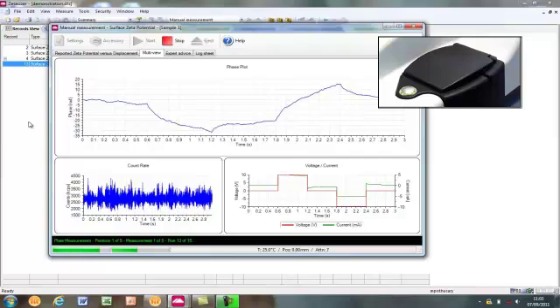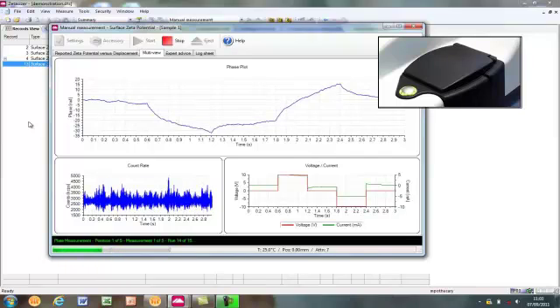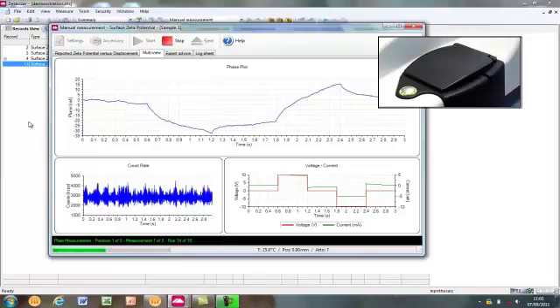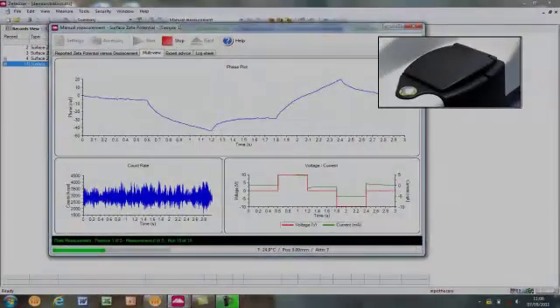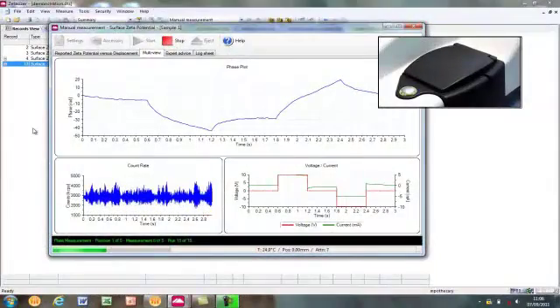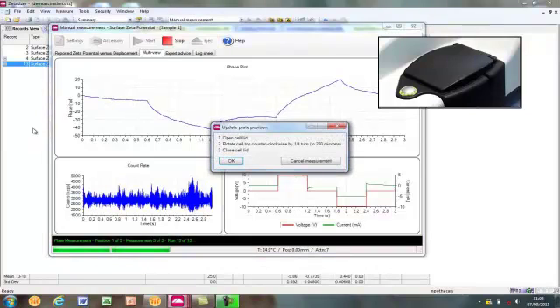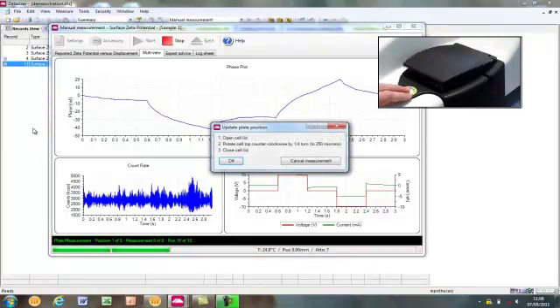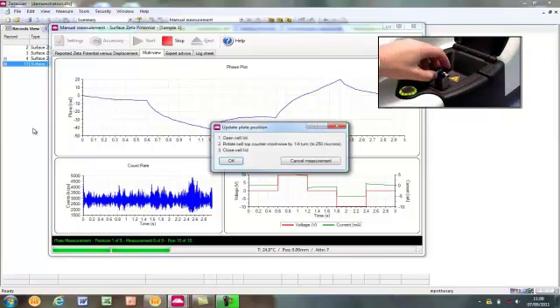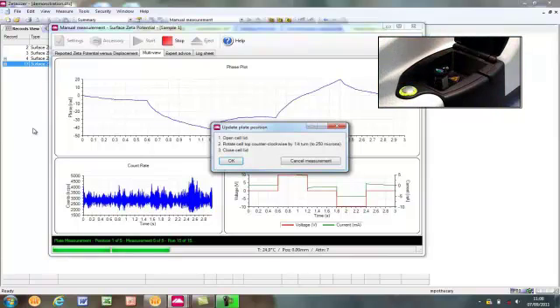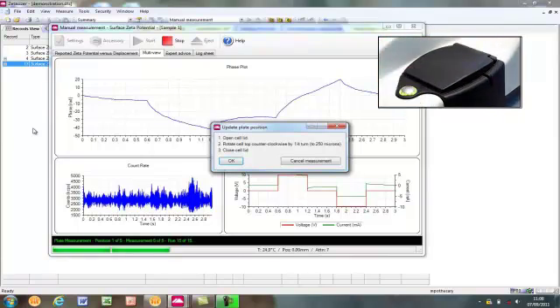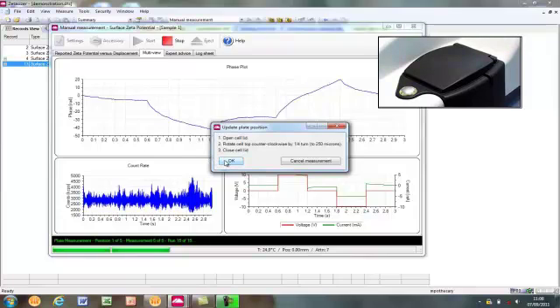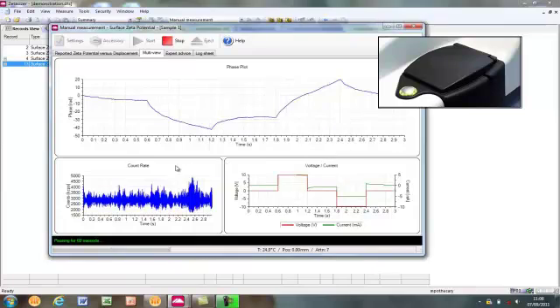Once these are finished, the software will ask the user to turn the cell to the next measurement position. This should be performed, as before, by following the instructions to open the lid, turn the cell cap, close the lid, and click OK to continue the measurement. This process will repeat until all of the measurements at all of the defined measurement positions have been performed.